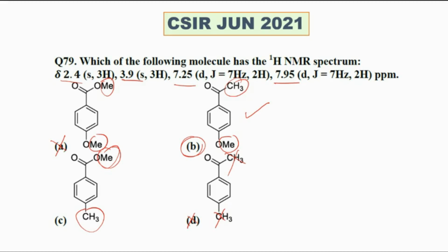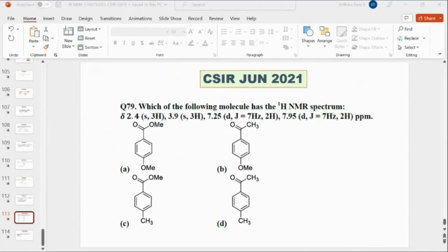Why? One benzene is attached to oxygen. In ether linkage ma'am, benzene is in. Okay, அது okay. So what? See, I have given you the clue. Value 7.25, 7.95. இத பேஸ் பண்ணி தான் சால்வ் பண்ணும். When you come for the next class, just tell me the answer, okay? Just go and learn about plus R group and minus R group and come back. OMe is electron donating ma'am.